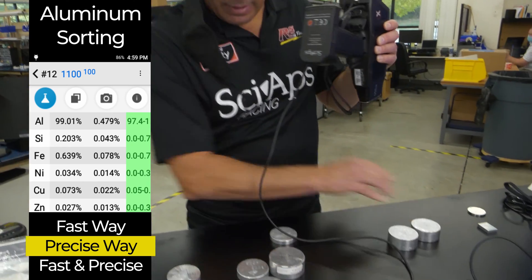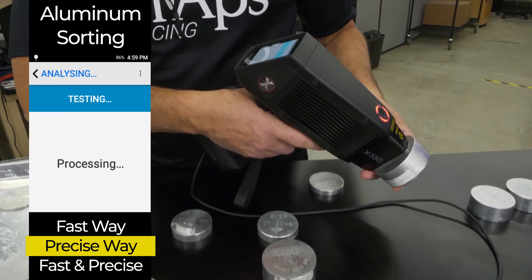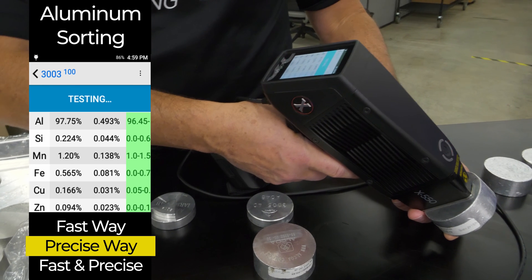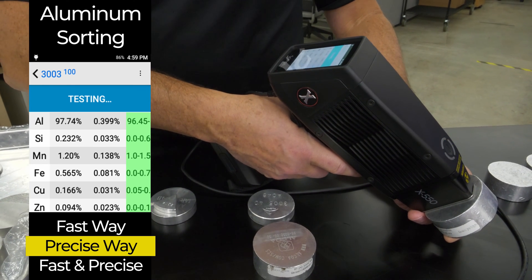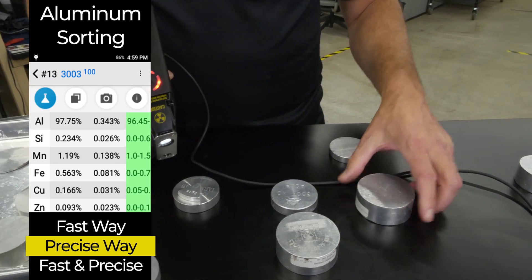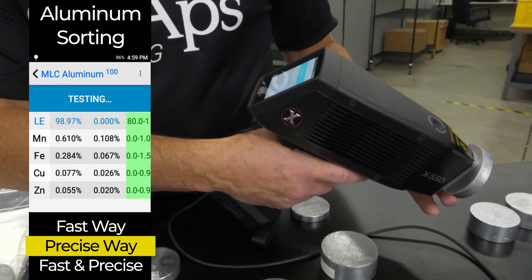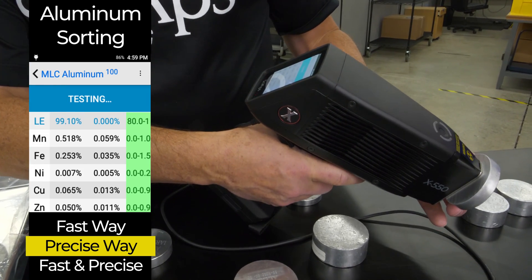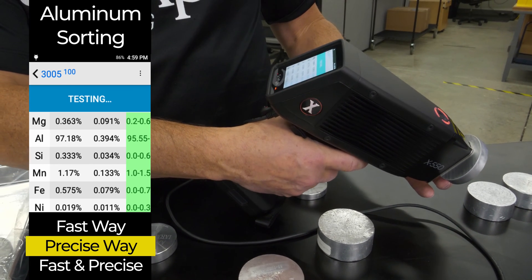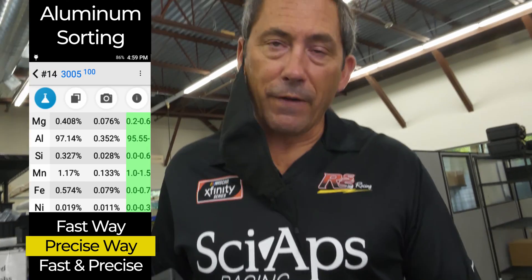Let me give you some other examples — probably less common stuff. Here's a 3003, and it just comes up and says it's a 3003 right there, perfect match. But if you didn't bother looking for magnesium and silicon, this could be confused with a 3005. The only difference between these two is the 3005 has about 0.3% magnesium. So let's shoot a 3005.